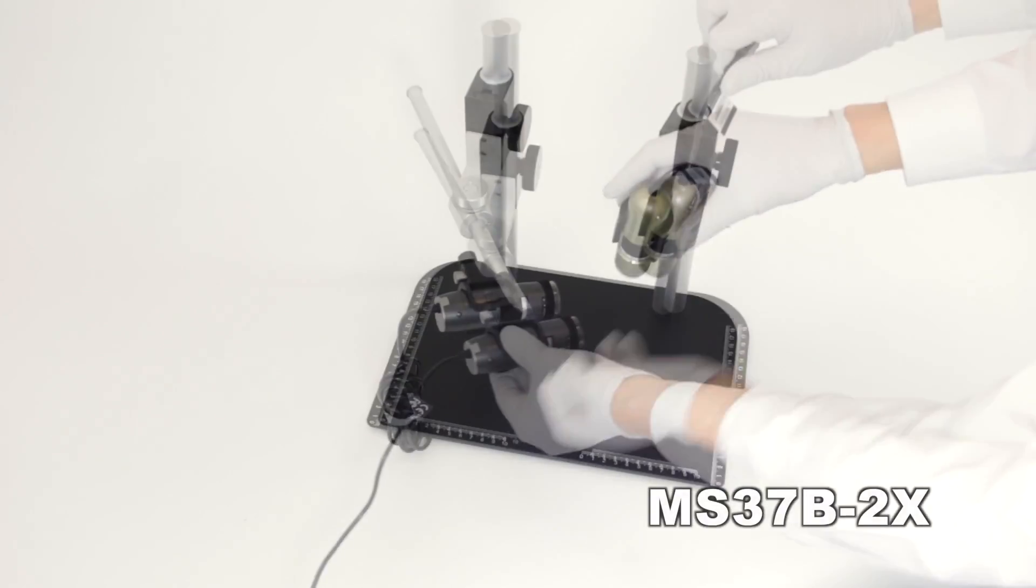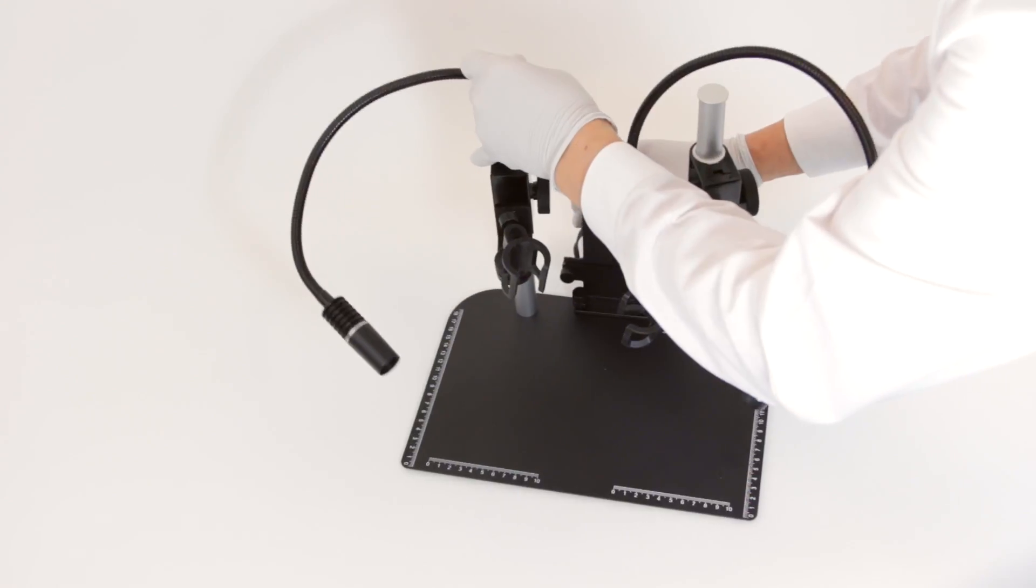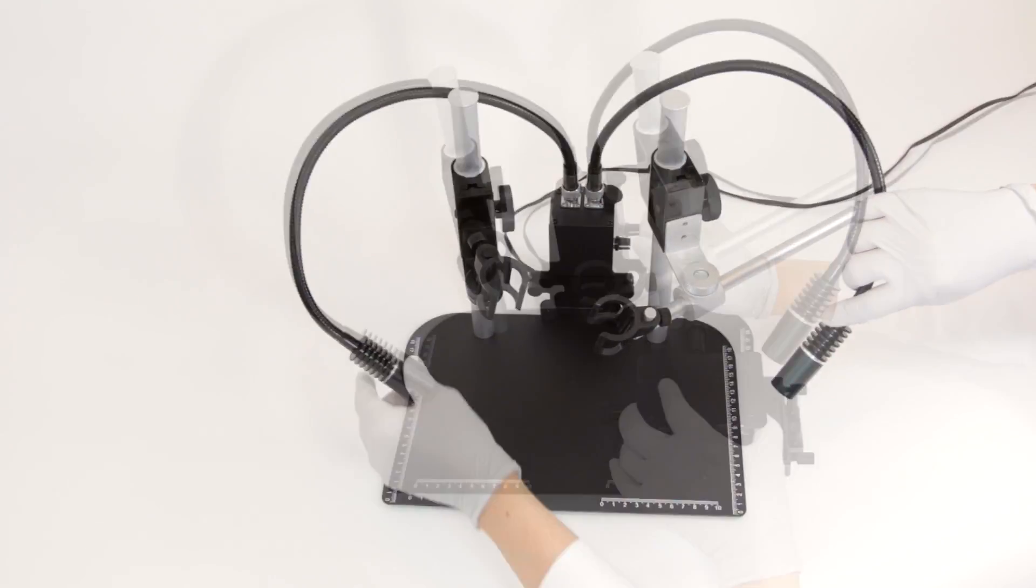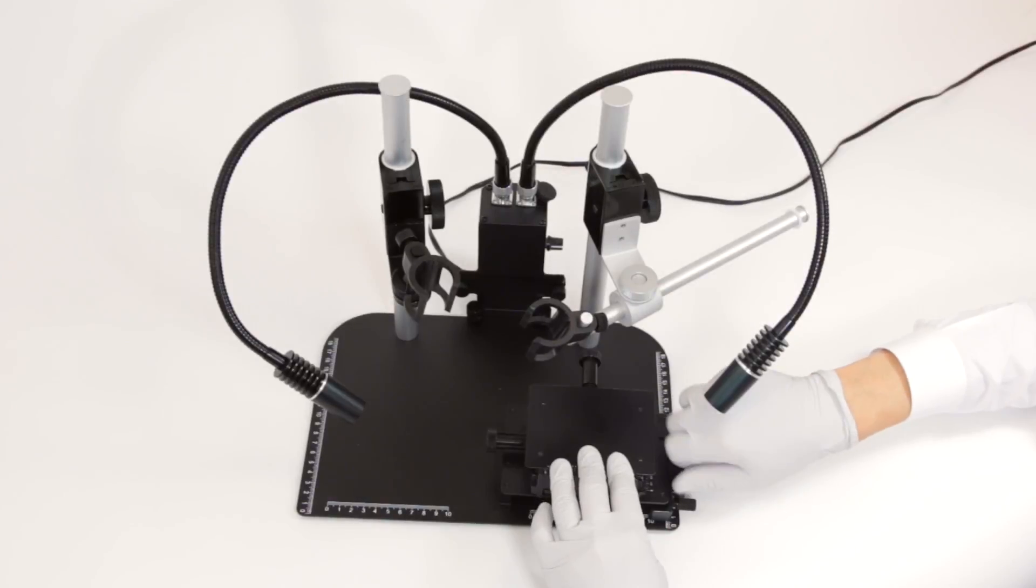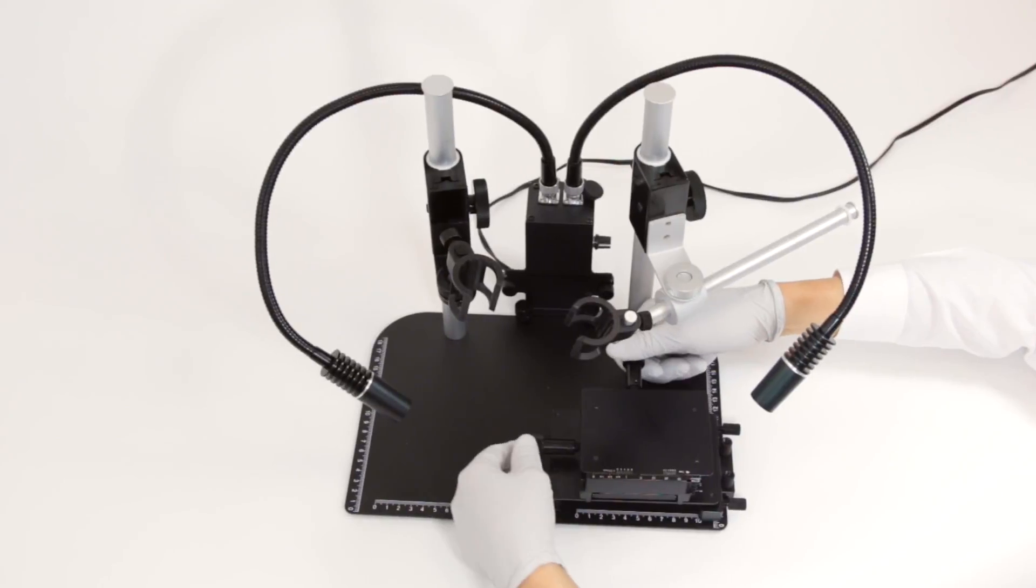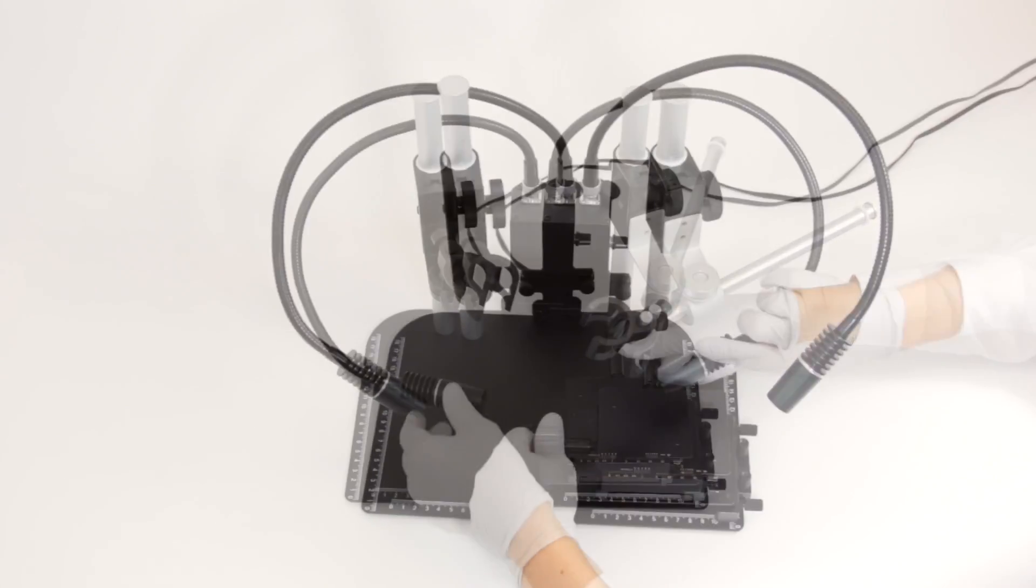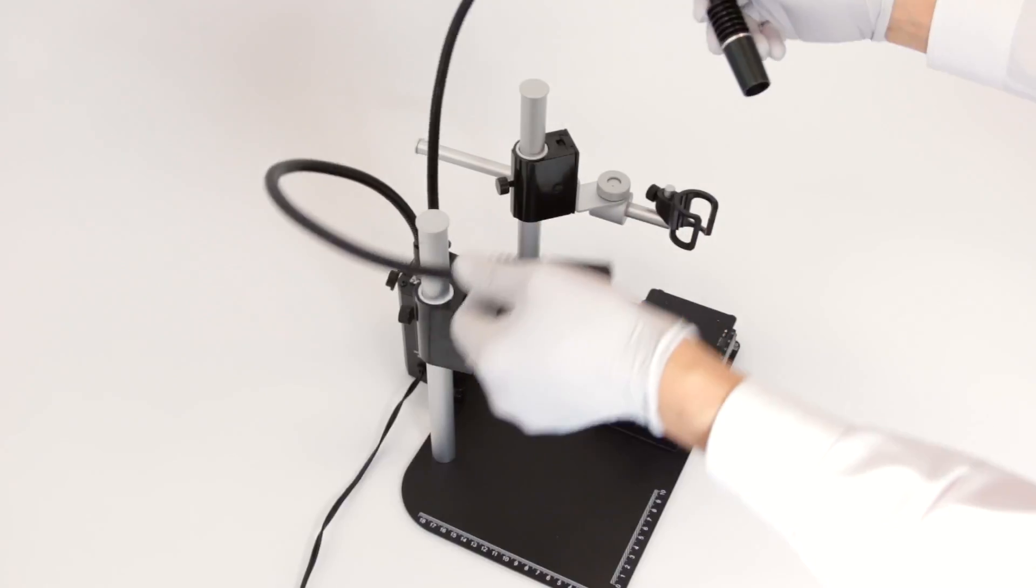The MS37B2X includes one standard block and one boom arm block for a mix of both options. This base is compatible with other accessories including the MSAK813 dual spotlight and the MS15X XY bases.